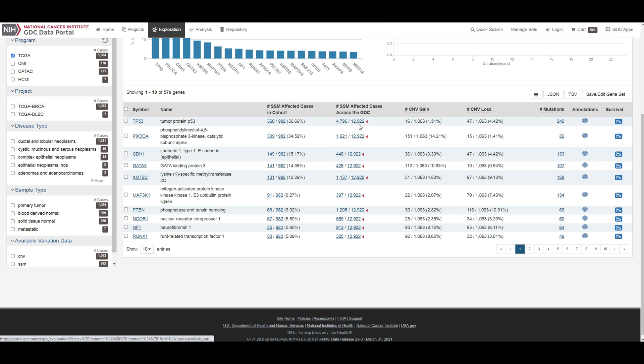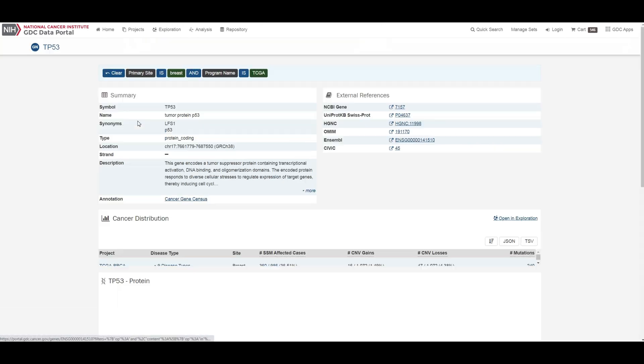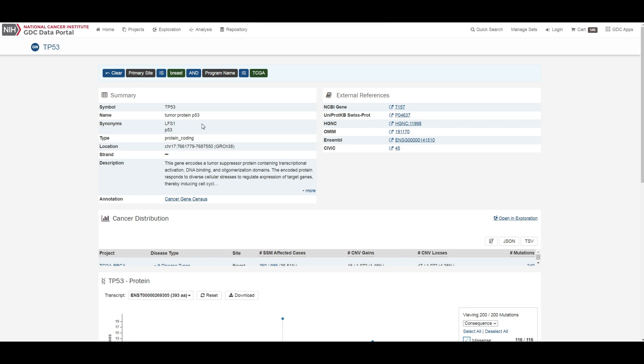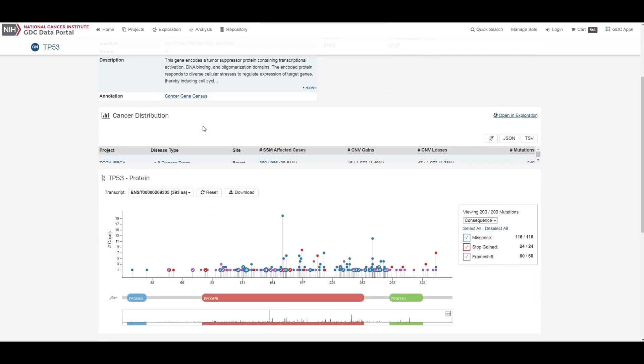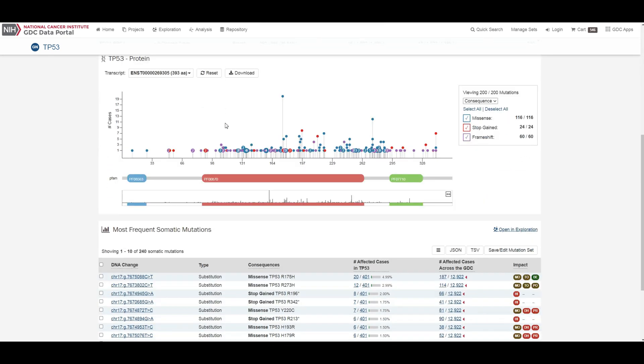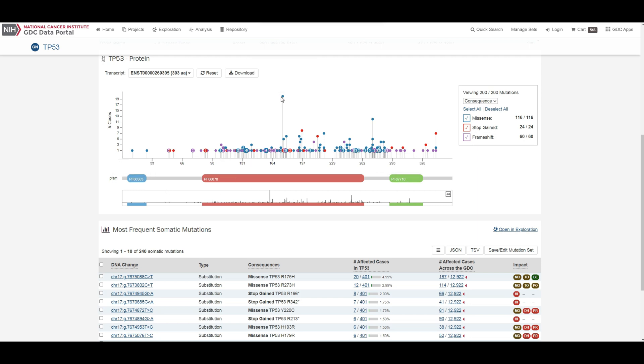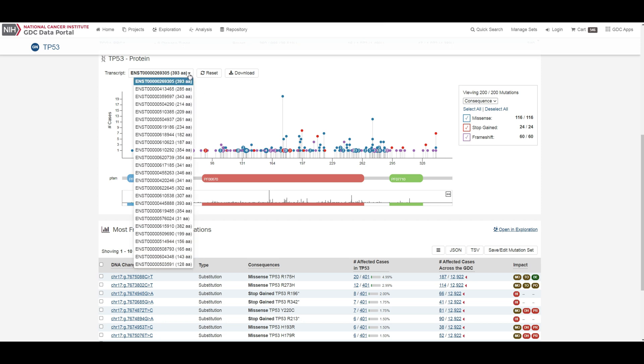Under the protein view, mutations and their frequency across cases are mapped to a graphical visualization of protein coding regions with a lollipop plot. Pfam domains are highlighted along the x-axis to assign functionality to specific protein coding regions. The bottom track represents a view of the full gene length. Different transcripts can be selected by using the drop-down menu above the plot.